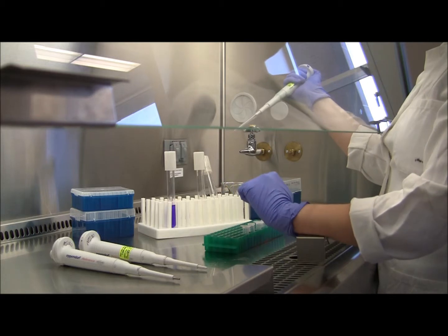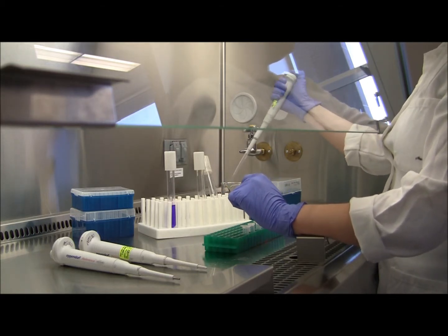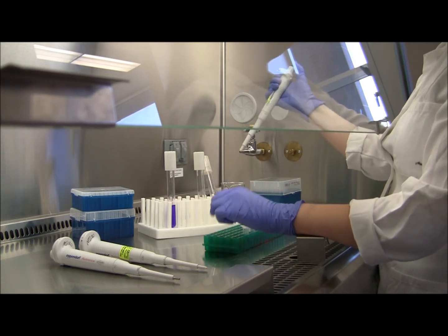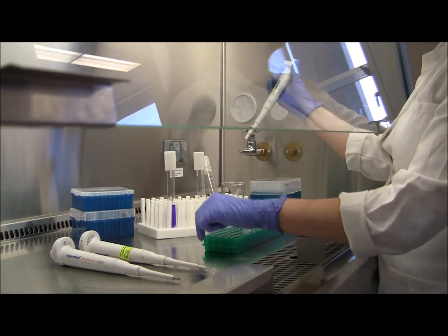When you're ready to get rid of your tip, you just want to press the plunger past that last stop until the tip comes off into the appropriate waste container.